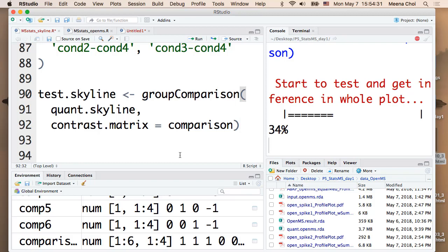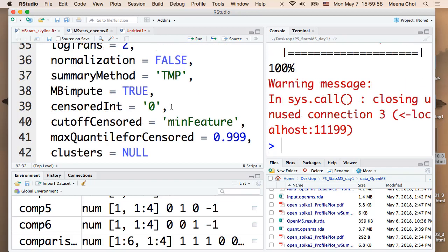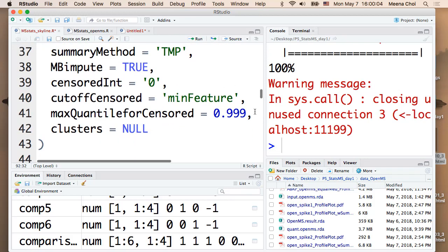The reason is that when I made this one, it was available for cluster, but there's a memory issue for laptops. It should work for your other computer, desktop or something, but for laptops the memory was a very frequent big issue, so I stopped making this one as a cluster. Sorry about this warning message, but you don't need to worry about it. That's fine.